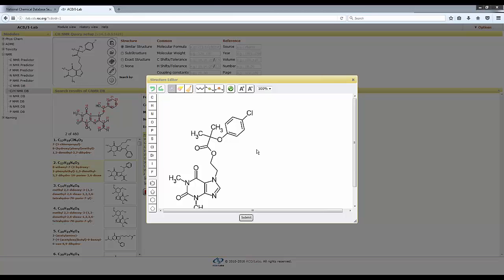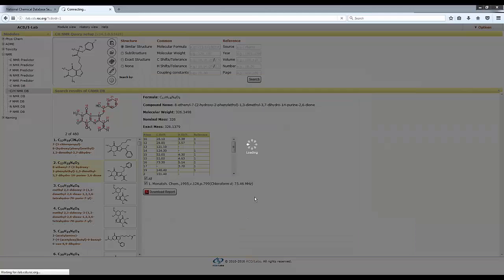And on a relevant question here, what abbreviations are allowed? So we see here that we have CH3 or whatever, so can I use any abbreviations? The answer here is generally, unfortunately, no. So you cannot use any abbreviation you may think. You can use the abbreviations that are included in the IUPAC table of abbreviations. And ideally, you should try to avoid using abbreviations. So even something like CF3 may not work. You have to explicitly define a carbon with 3 fluorines.